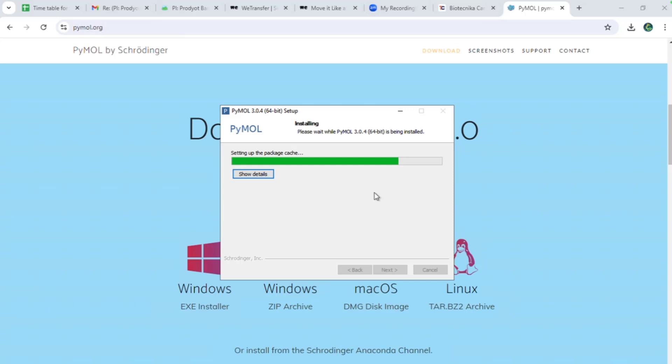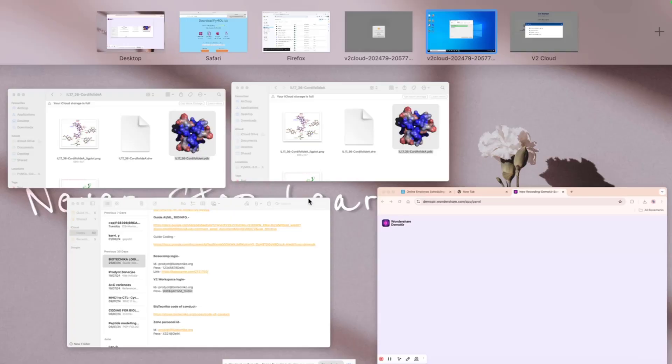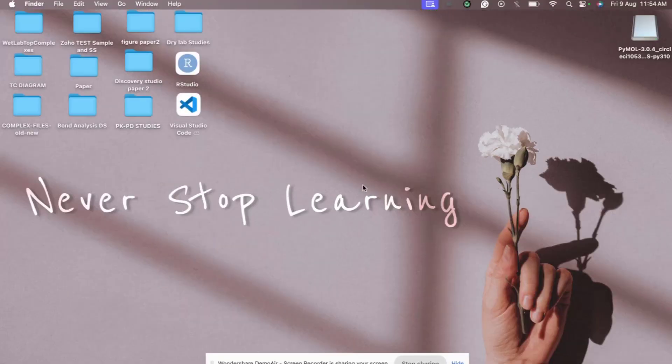The environment is now setting up on the Windows system. While the installation is in progress, I'll switch to the Mac system to show you the PyMOL interface and how it actually looks.